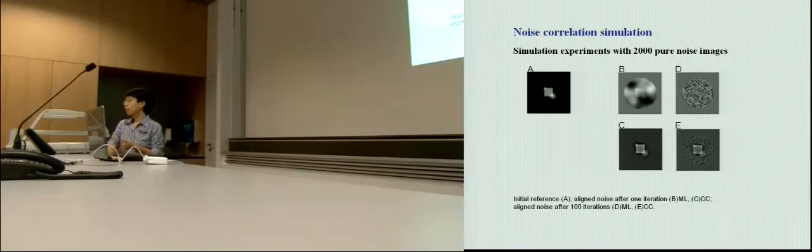Now, if you have, for example, images with different signal-to-noise ratios, let's say image data 1 and image data 2, where image data 1 has half the signal-to-noise ratio of image data 2. If we double or even triple the number of particles in image data set 1, can we expect the same result from the two data sets?